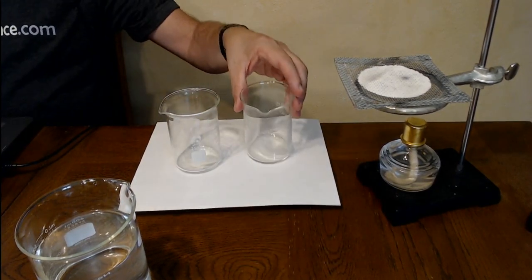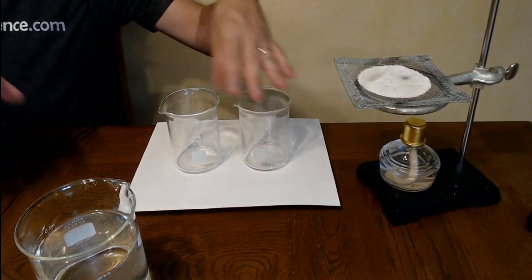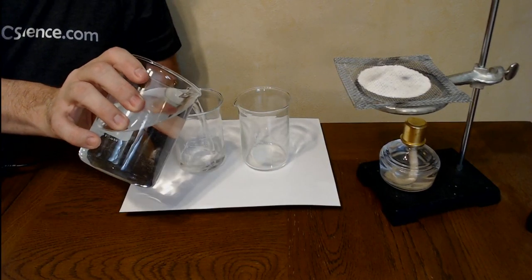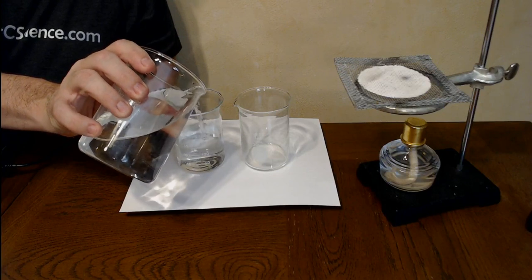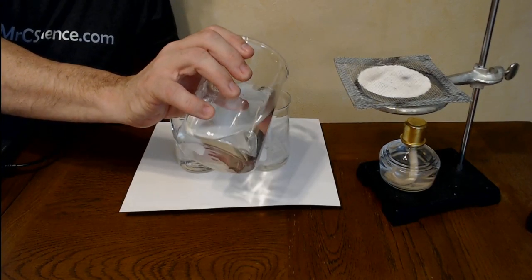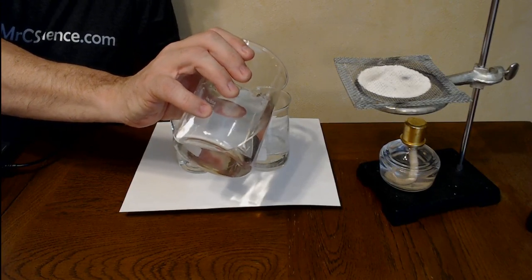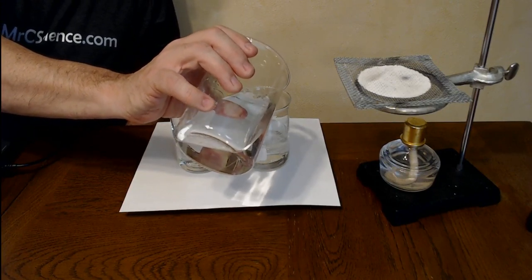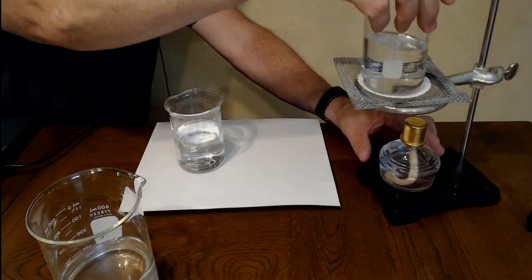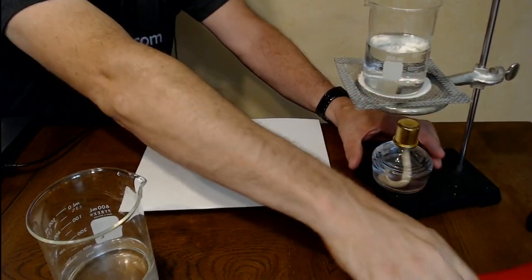Okay, so what we're going to do is we're going to take two beakers. We're going to put about the same amount in each beaker, so I'm going to put about 150 milliliters in each beaker here. They don't have to be exactly the same, but they should be pretty close to the same. Reduce the number of experimental variables you have. So one of these I'm going to put on and heat it up.